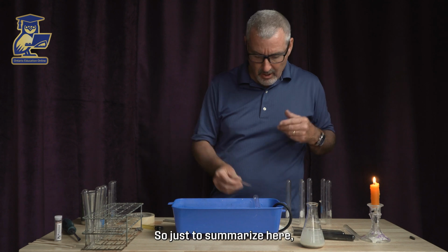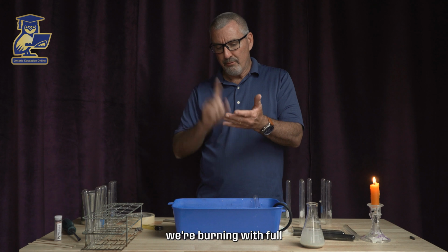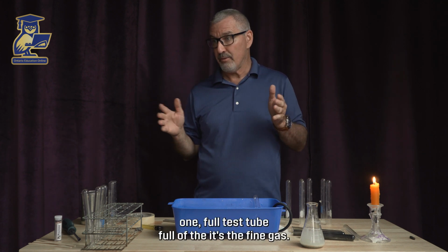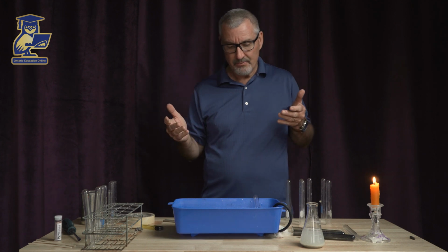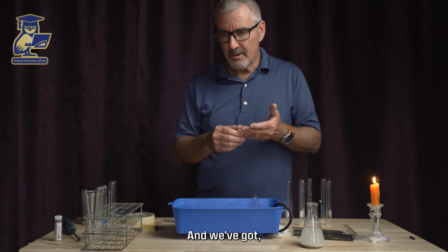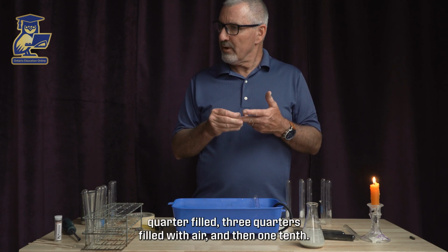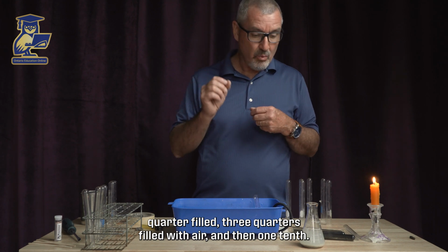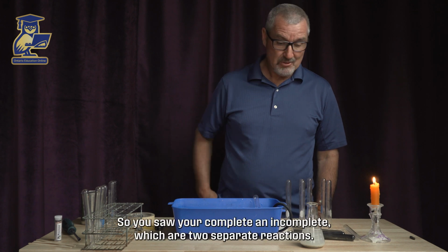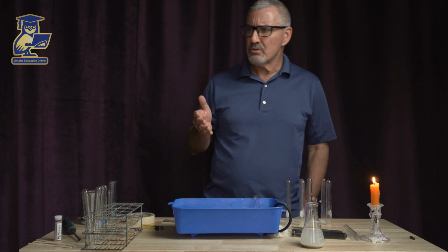Just to summarize, we're burning a test tube full of the ethyne gas, the flammable gas, and we've got half filled with air, quarter filled, three-quarters filled with air, and then one-tenth. You saw two different types of combustion there, complete and incomplete, which are two separate reactions.